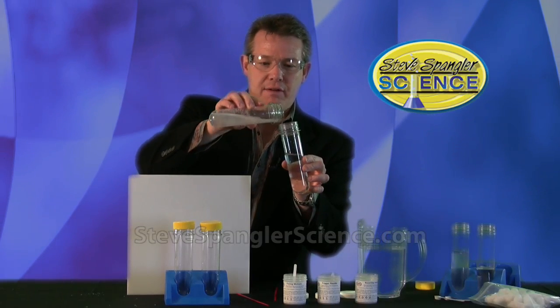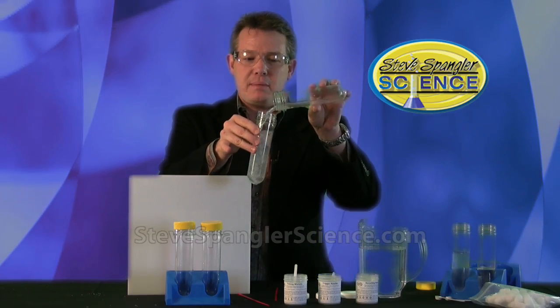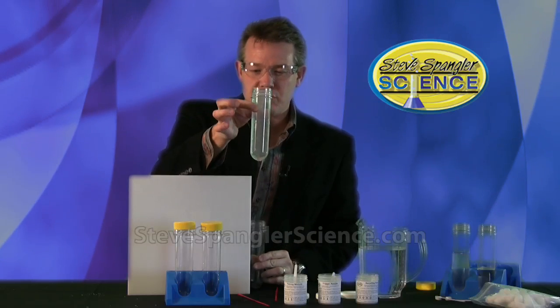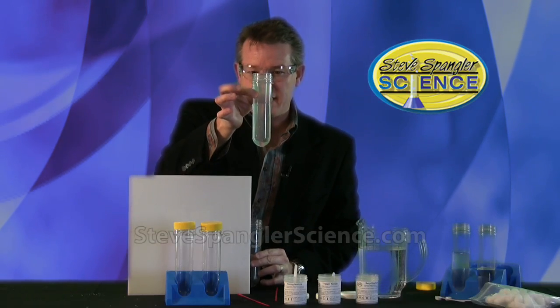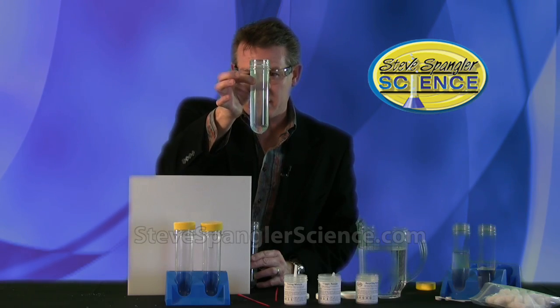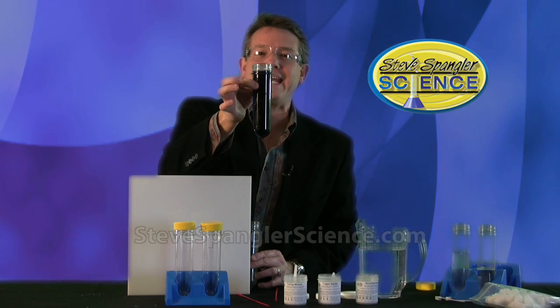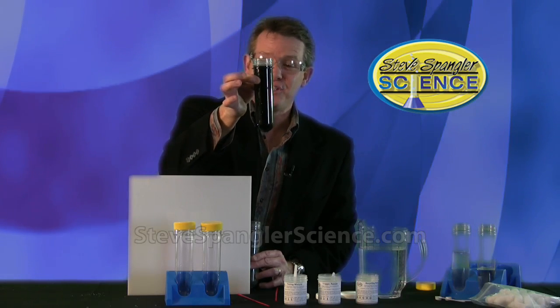Let me show you one of my favorite pieces of chemical magic. Watch this. Two colorless liquids get mixed together — just stare at the liquid. It almost looks a little bit different right now. It doesn't look as clear as it once was. If you look very carefully it looks just like ink, doesn't it? And this is called Think Ink.